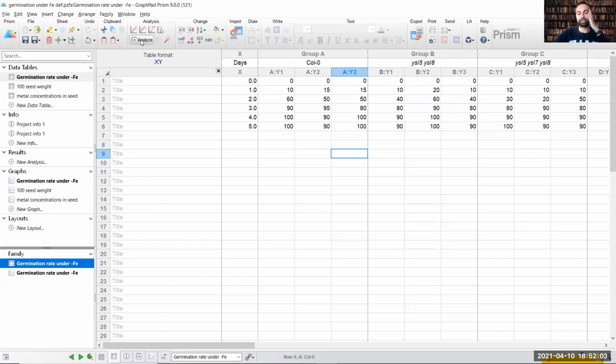You will have a great time. Sorry, you will save great time using this software, but more importantly, you will not lose the essential information of the experiments, even after a lot of years. Go for it.